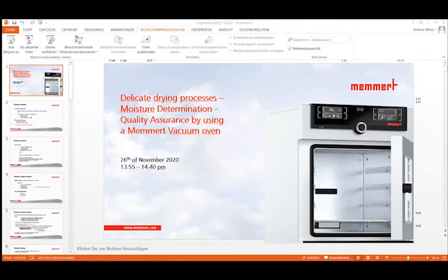So when we talk about physical drying, as mentioned, we have convection, oven drying or vacuum drying. And here I would like to mention again vacuum drying in industrial processes. That is very important for very sensitive material, also for drying of blind holes, or for example drying in pharmacy. So for all different industries, the drying process is very important, and the methods vary with material and application.